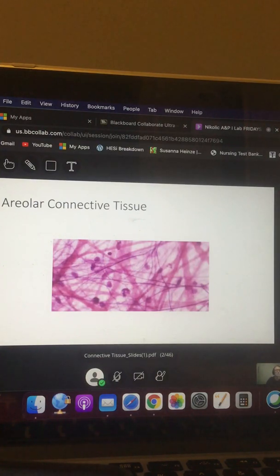What is this? Go. What is it? Look on your list. You have 4 things. What could it be? Collagen fiber. All right, awesome. That's what I want. Go. Now, are you ready? What is this? Go. It's on the list. I only have 4 things. What in the world could it be? Elastic fiber.